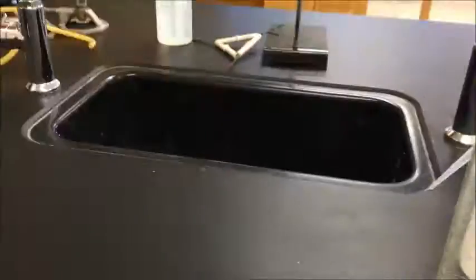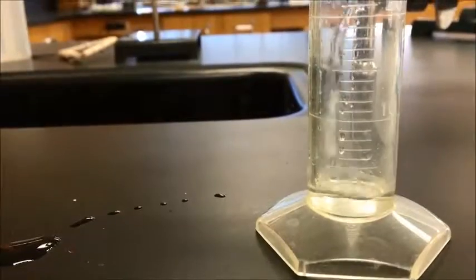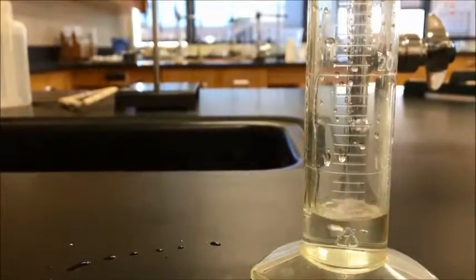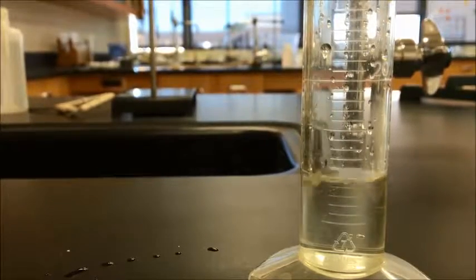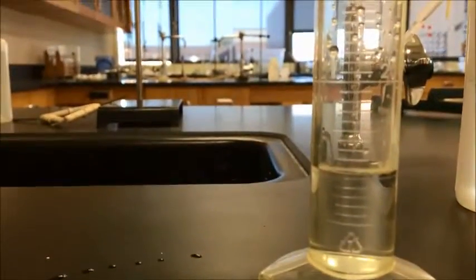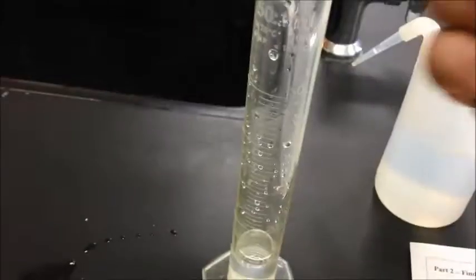So I suggest setting your graduated cylinder to about, oops, I missed, 10 milliliters. Remember, you got to get down low, read the meniscus, set it to about 10 milliliters as your initial volume. A little swish. That's just about a perfect 10 milliliters. So your initial volume is what volume you start with without the marble in there. And the final volume is the volume that it rises to once you've added your marble.